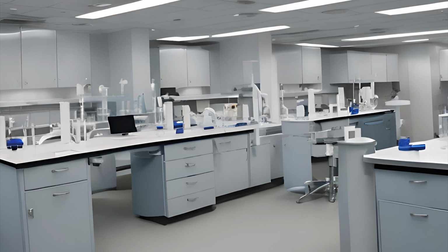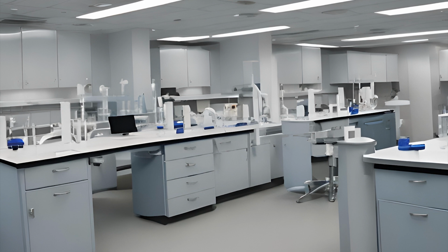Chilling the specimen can slow down blood cell metabolism and prevent the destruction of thermolabile analytes. What that means is something you're looking for that is altered or destroyed by heat. Blood specimens that require chilling, such as ammonia, lactic acid, and gastrin, should be completely immersed, the tube will be completely immersed, in a slurry of crushed ice and water. Just cold water alone is not enough. Just ice alone is not enough.